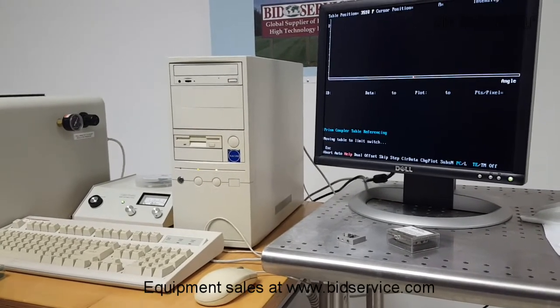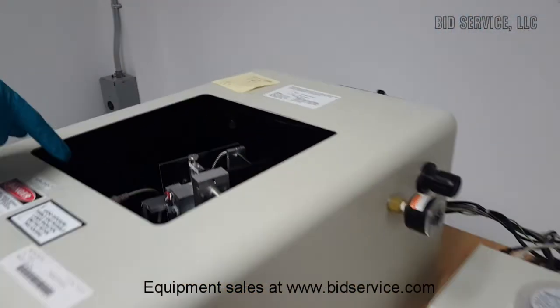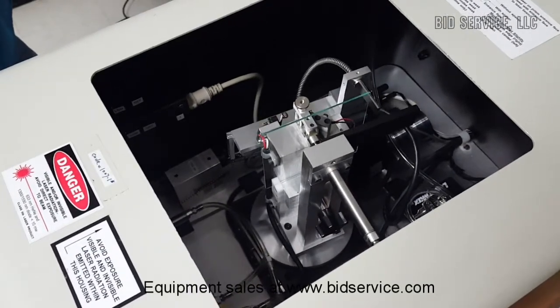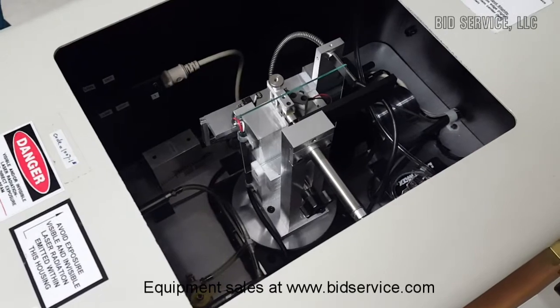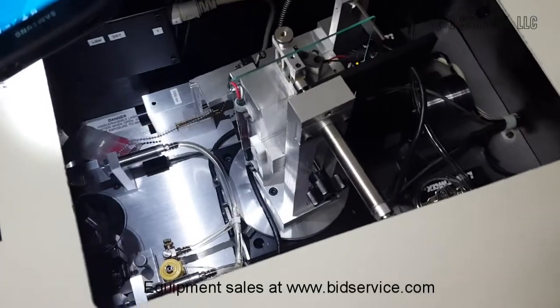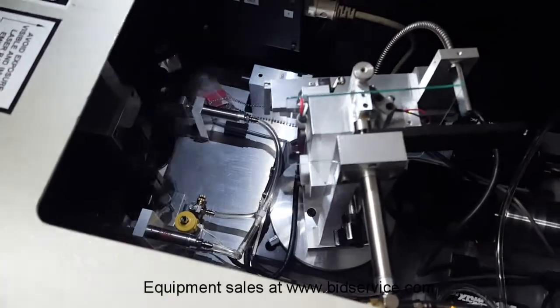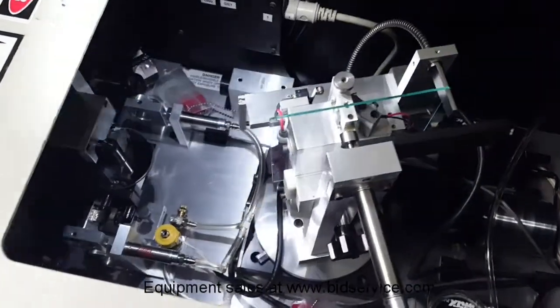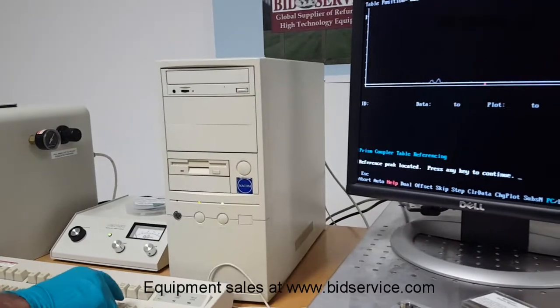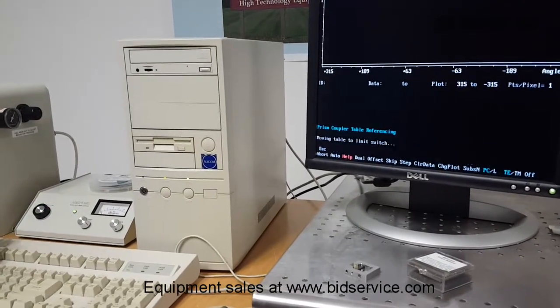During the referencing, the table will turn all the way to the limit switch. The limit switch is over there. The system will hit the limit switch and it will proceed to do the reference measurement. I want to demonstrate how you can reference it again. So Home, and then press F1.